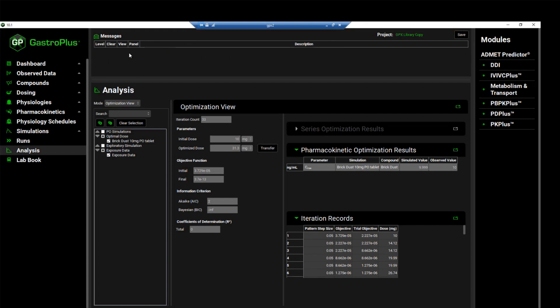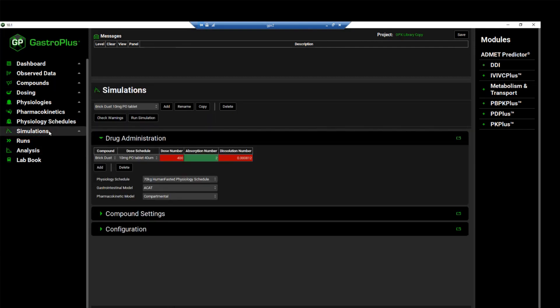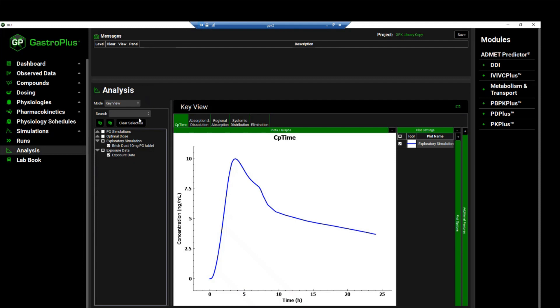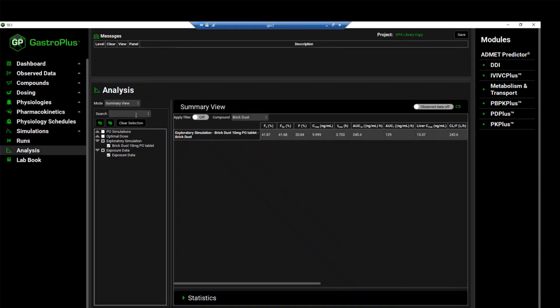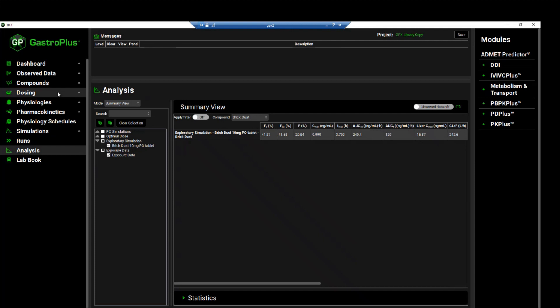Now we will navigate to the simulations view. And with the brick dust simulation selected, we will click on check warnings and then run a simulation. When the simulation is done, you can switch the view to summary view to confirm that the CMAX achieved was approximately 10 ng per ml. Now, you can also come to the dosing view to see the updated dose that you have transferred.